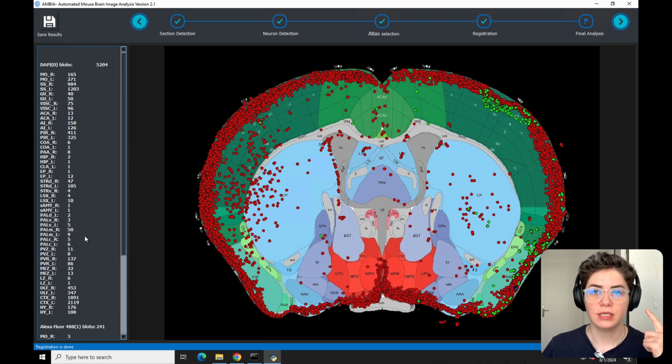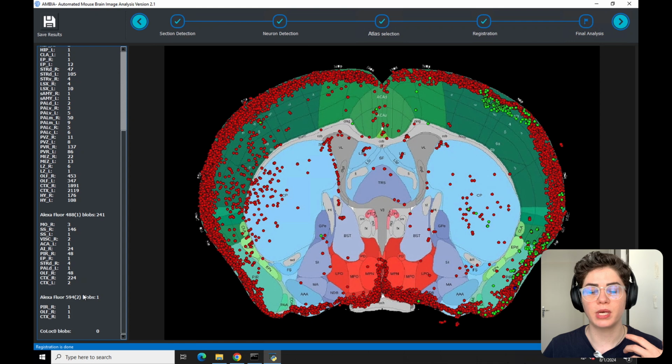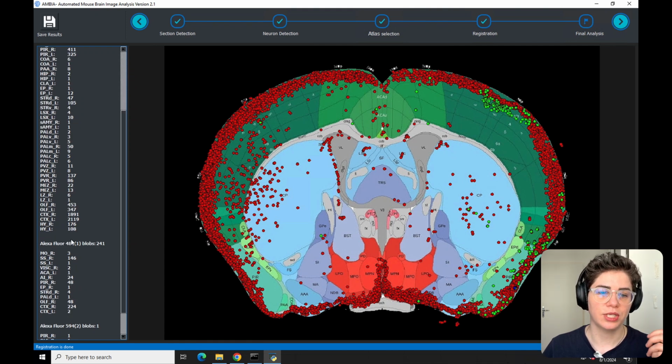Please keep in mind that this shows 0, 1, and 2 because in Python, the numbers generally start from 0, not from 1. So know that channel 0 is actually channel 1 and channel 1 is channel 2. So add 1 to it.